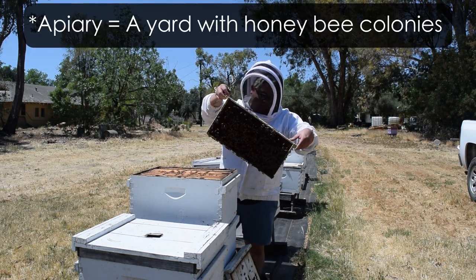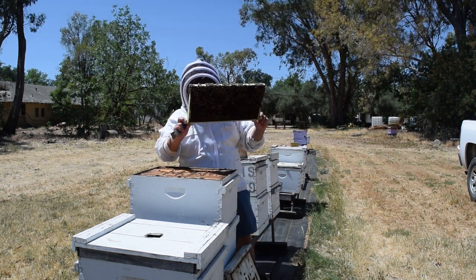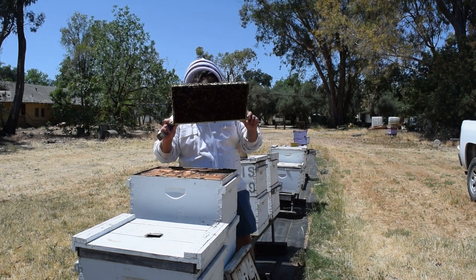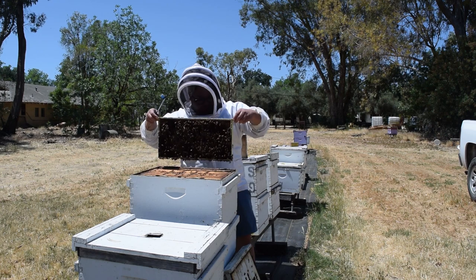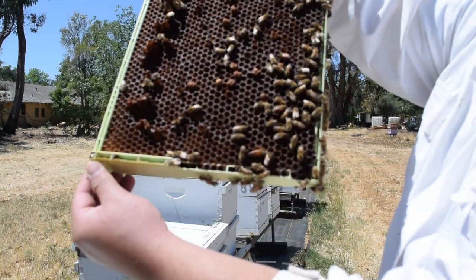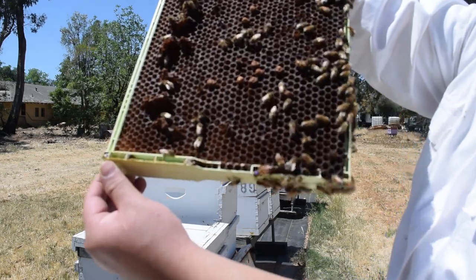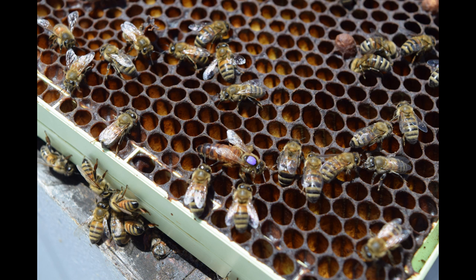I got two pretty good frames from that first colony, but I was looking for one more frame of drone brood. Unfortunately, no other colony in that apiary had that, so here I am working in another apiary — sometimes finding emerging brood can be a bit of a wild goose chase. I looked at a drone brood frame and decided it wasn't the best, but then I realized the queen was on it and figured you guys might want to see that. I ended up taking a couple of pictures of her, which shows much more clearly just how different the queen looks compared to the sterile female workers. She's clearly larger, has an extended abdomen for laying eggs, and has a little paint mark on her to make it easier for us to spot her when working through a colony.